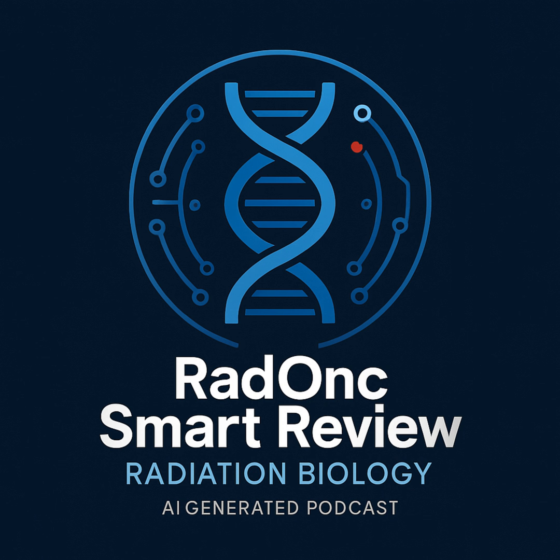Precisely. It's an immunofluorescence method. You treat your cells, maybe radiate them, then fix them to preserve their structure, and permeabilize the cell membrane so antibodies can get in. Then you incubate with a primary antibody that specifically recognizes the gamma H2AX modification. Okay. Wash away unbound antibody, then add a secondary antibody. The secondary antibody binds to the primary one and has a fluorescent dye attached. Common ones are FITC for green fluorescence or Alexa Fluor 594 for red. Then you look under a fluorescence microscope.